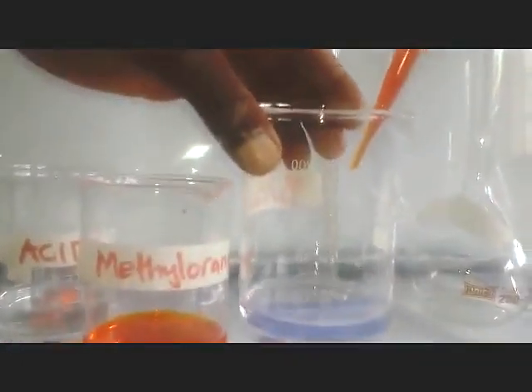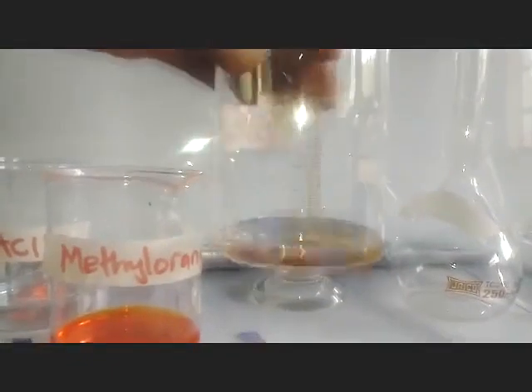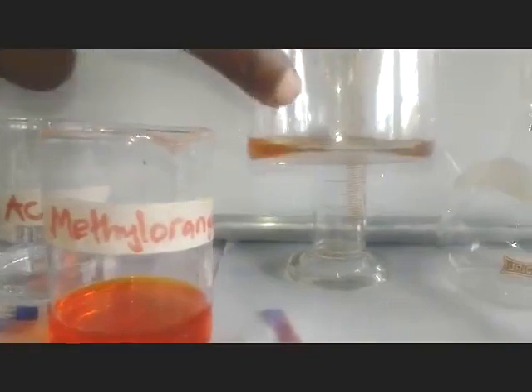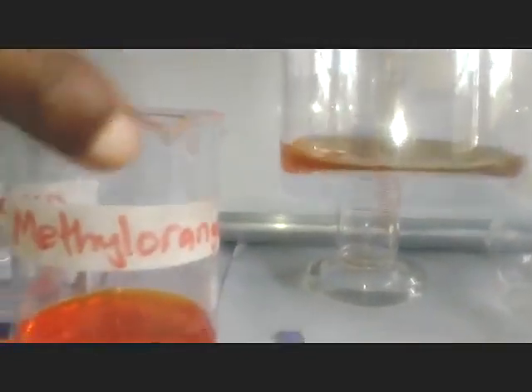In this base, I'm going to put some drops of my indicator. This is my indicator and my dropper. Then I put some drops there. And I put the first drop. Then you can see what happened in the solution. Then if I add more, you check what is going to happen. Now comparing this color and this color, you can see a very big difference. This is the yellow one we are talking about in the base. This is the base, the yellow one we are talking about.